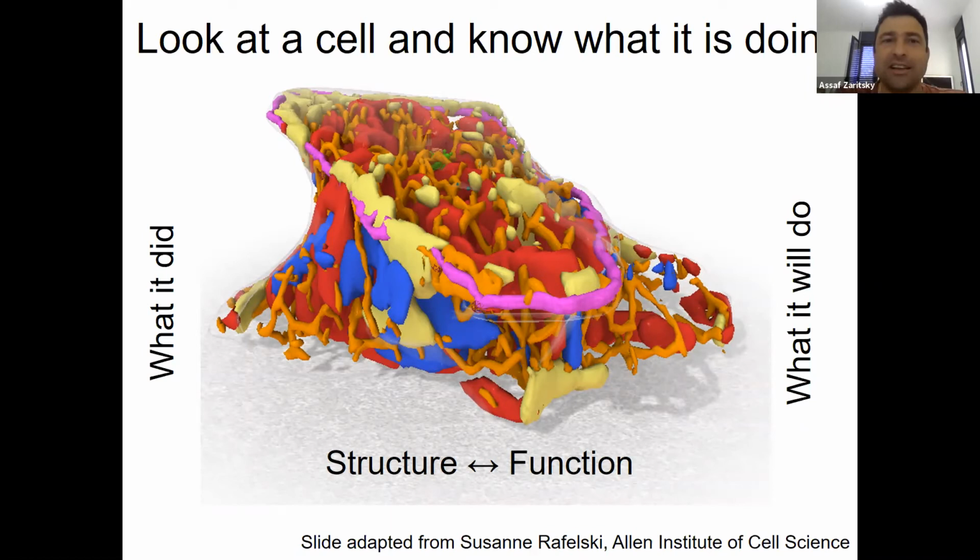Why? Because each time we can tag one molecule, two molecules, three molecules. Look at the images that I showed you before. You can see just one color or two colors or three colors. So we cannot get an integrative picture of a cell by tagging fluorescent molecules to each of the specific organelles. Organelles are like organs. And from that, understand the complexity of its organization and how it correlates to the function of the cell. And it's a technical limitation because the molecular biology is difficult, trying to tag all of these fluorescent molecules to each of the cells.